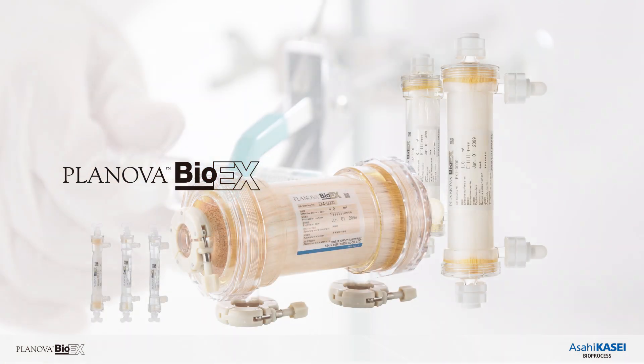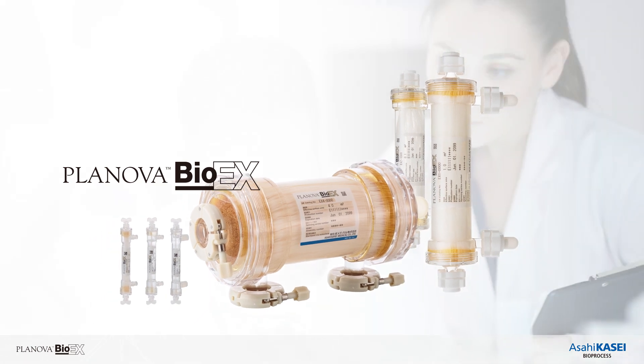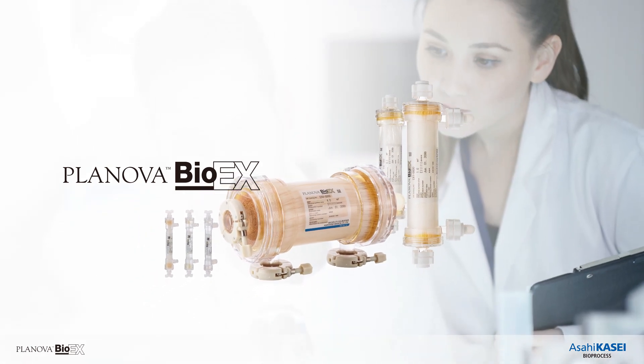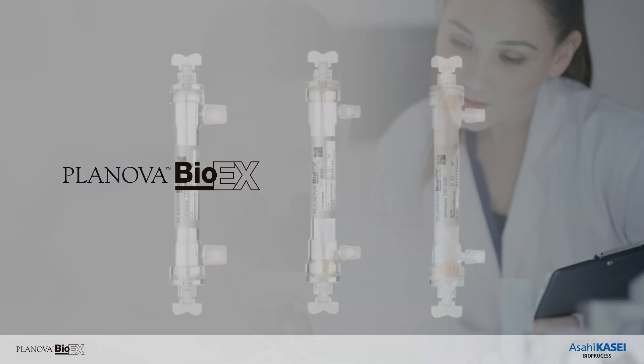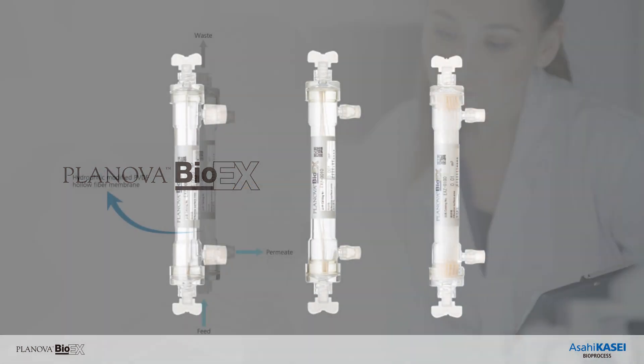There are various sizes available for Planova Bio-EX, compatible for lab to commercial production. The lab scale filters introduced in this video are the sizes typically used in phase 1 development or virus validation studies.